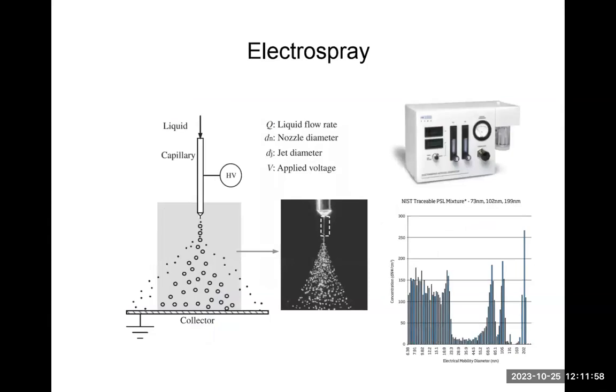So as we said, these atomizers or nebulizers don't have specific controls of the droplets, and their droplet size is relatively large, normally around 10 micrometers, which is quite large. Once they're dried up, these droplets will shrink into, let's say, hundreds of nanometers, or 60, 70 nanometers. What if you want to generate smaller aerosols? What about 20 nanometers, 30 nanometers? To do that, we need to generate droplets with smaller sizes. One commonly used method is the electrospray.